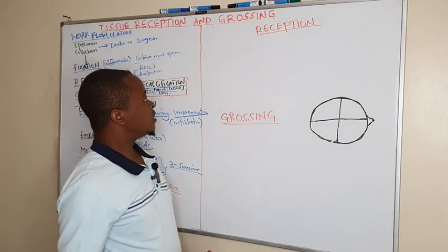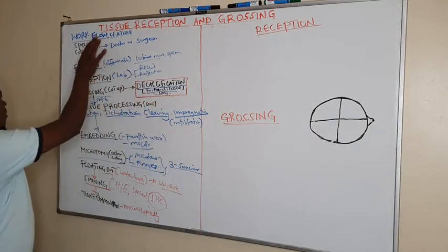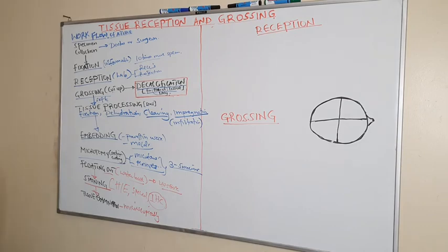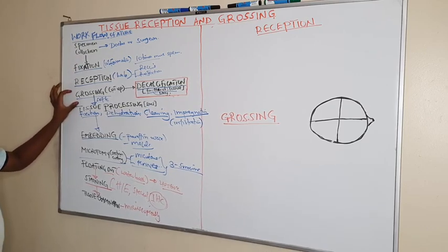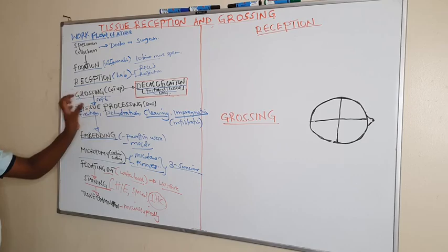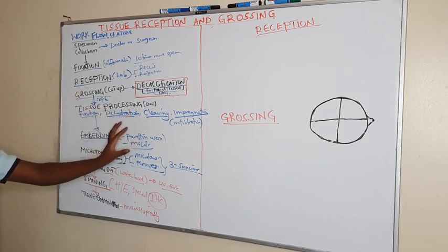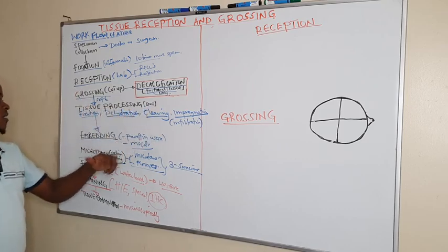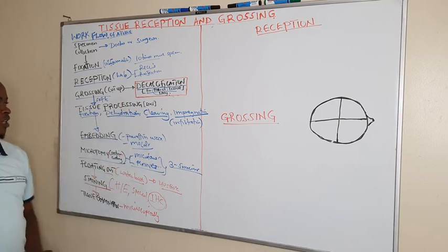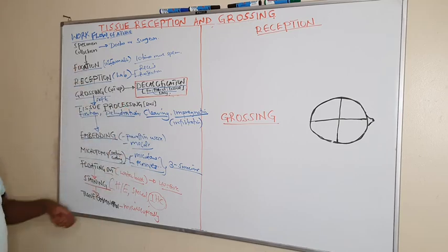But so after seeing this workflow of the tissue after being received for histopathological purposes, whereby we have seen specimen collection, fixation, reception, grossing, and we have said for hard tissues they can be decalcified. Then soft tissues go directly under tissue processing, where we have used the mnemonic FDCI, whereby it is fixation, dehydration, clearing, and impregnation, which we shall discuss in detail.